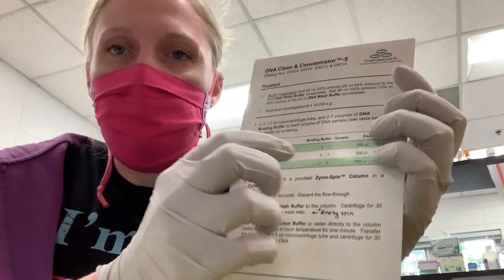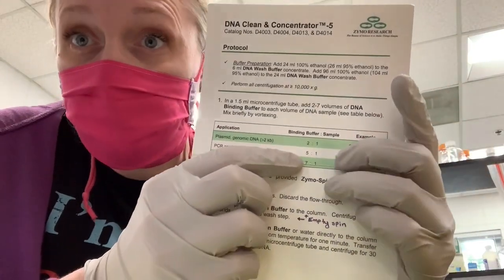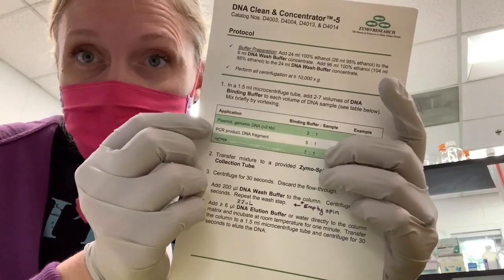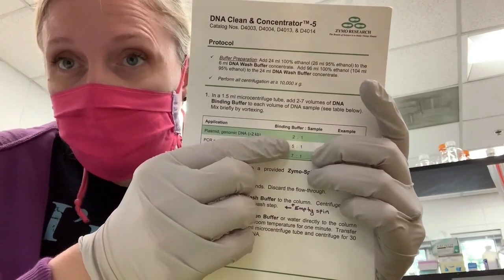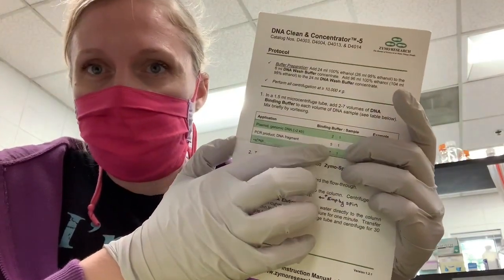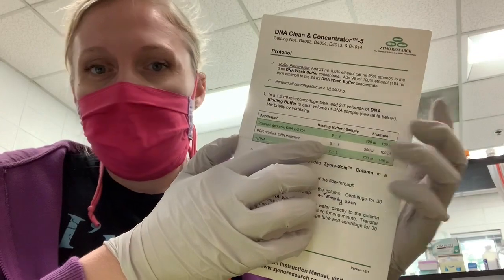Okay, and just to clarify with that, I've now added my binding buffer to each sample, and I have transferred them into the tubes. I wanted to clarify, I had used the 7:1 and I had 50 microliters, so that's 350 microliters. For PCR, you can also use 5:1 and it will also work. And so you may try in your own hands if you think 7:1 or 5:1 works better, but either could work.